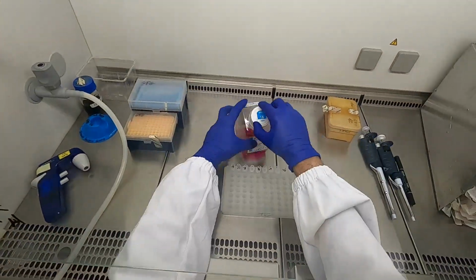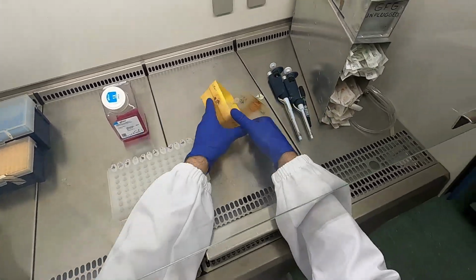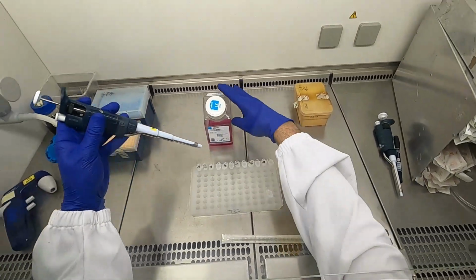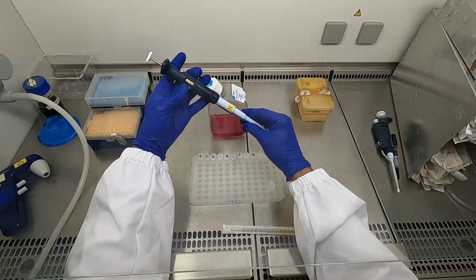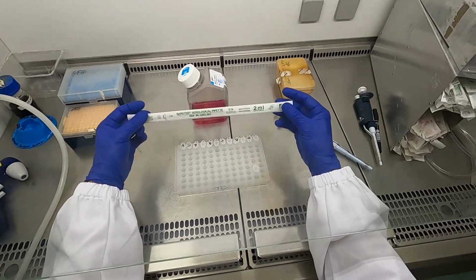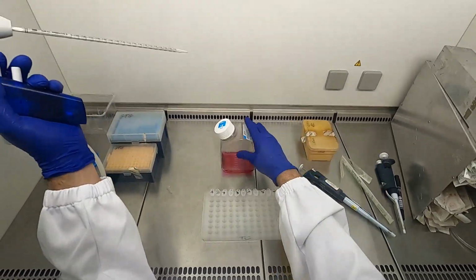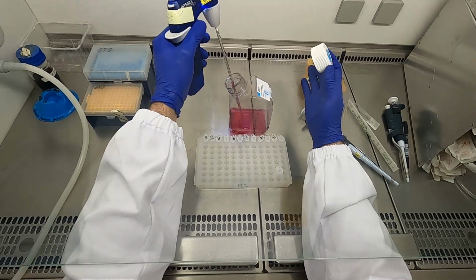So we know we need 1.12 microliters of HDFSF stock in 1 ml of medium. And in order to get the 1 ml from the flask, you could use the P1000, very accurate. However, that pipette is rather dirty because only the tip we put on is sterile, coming from the blue box. And you would have to go in with the pipette past just the tip.